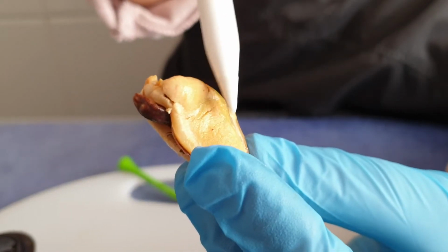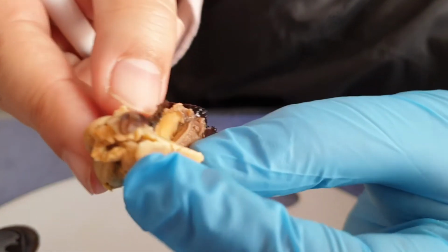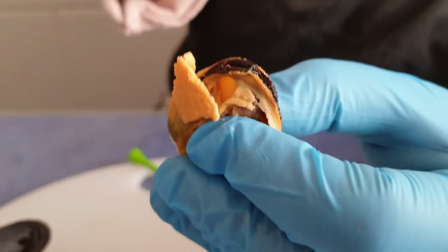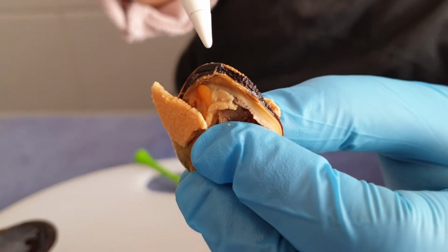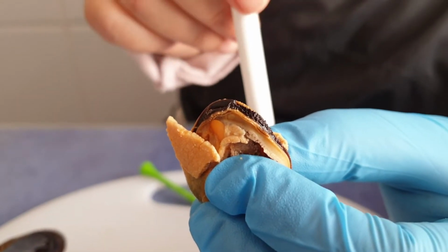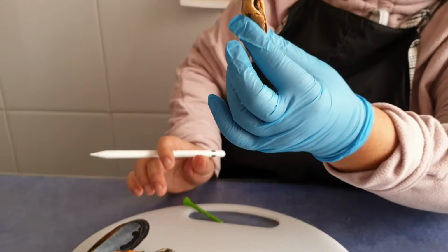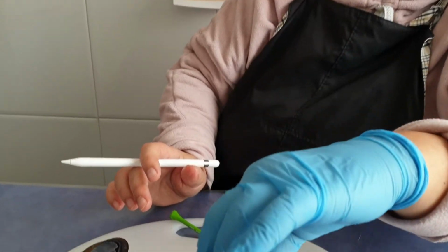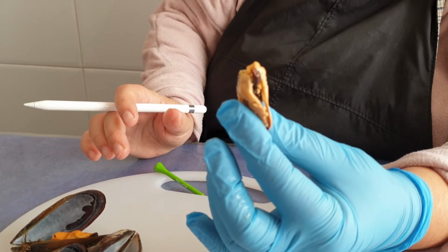This part that is like a coat is the mantle. The mantle protects all the organs that are inside. Look at this. More things. This black edge is the edge of the mantle, and it is used for identifying the light and the darkness. This is why the mussel decides to go to the surface, because there is more food on the surface, or they decide to go to the depths because they are in danger and they need to keep safe.